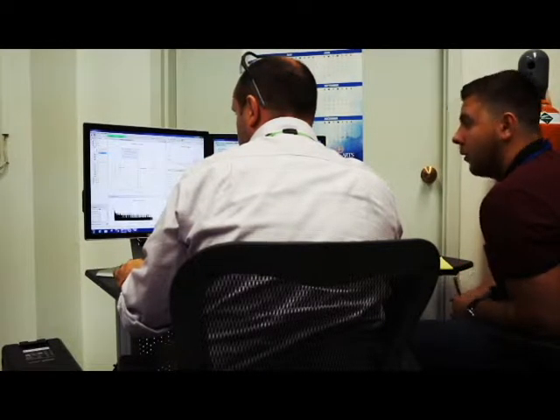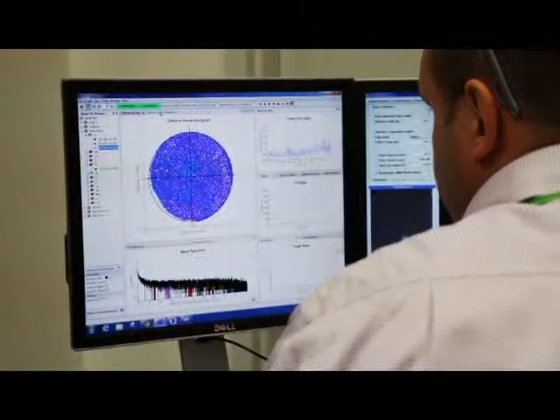The strength of the atom probe is that we really have very high resolution, high fidelity data that comes off this, and it's in 3 dimensions. So whereas TEM can give us a lot of information, it's typically only in 2 dimensions. This gives us a 3rd dimension.